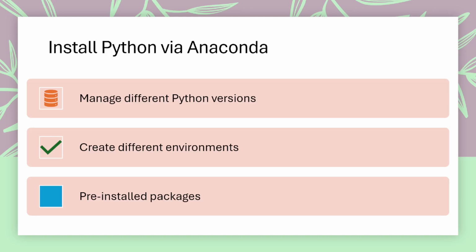As you can see, the latest Python is 3.12, and if you're working on any other Python project, you may want to create a different environment for it. I would strictly remain on a different environment for Opentrons because the dependencies may cause your protocol simulation to fail. And using Anaconda, you can also quickly create different environments. It's much less tedious for a new user.